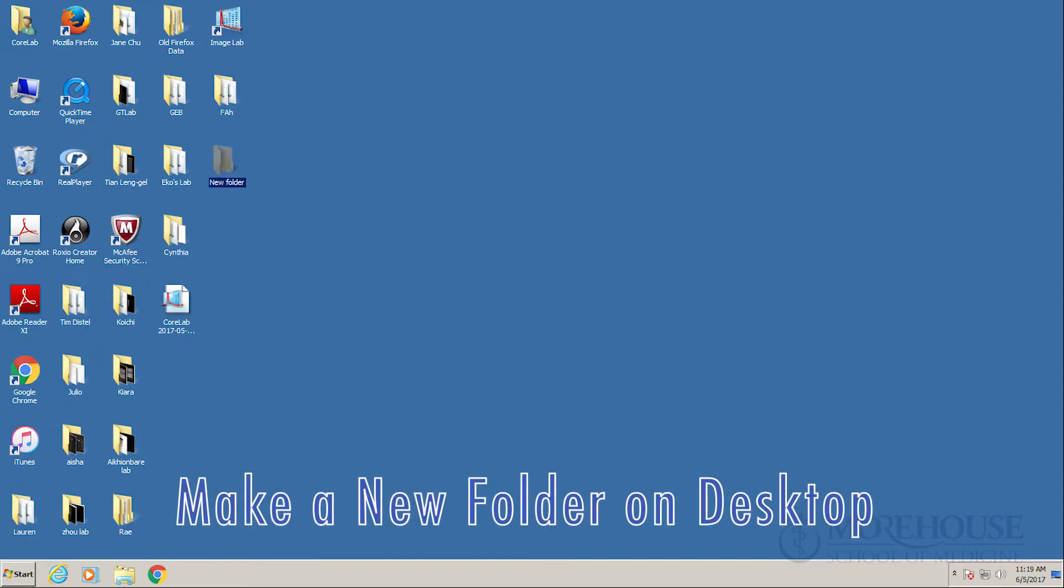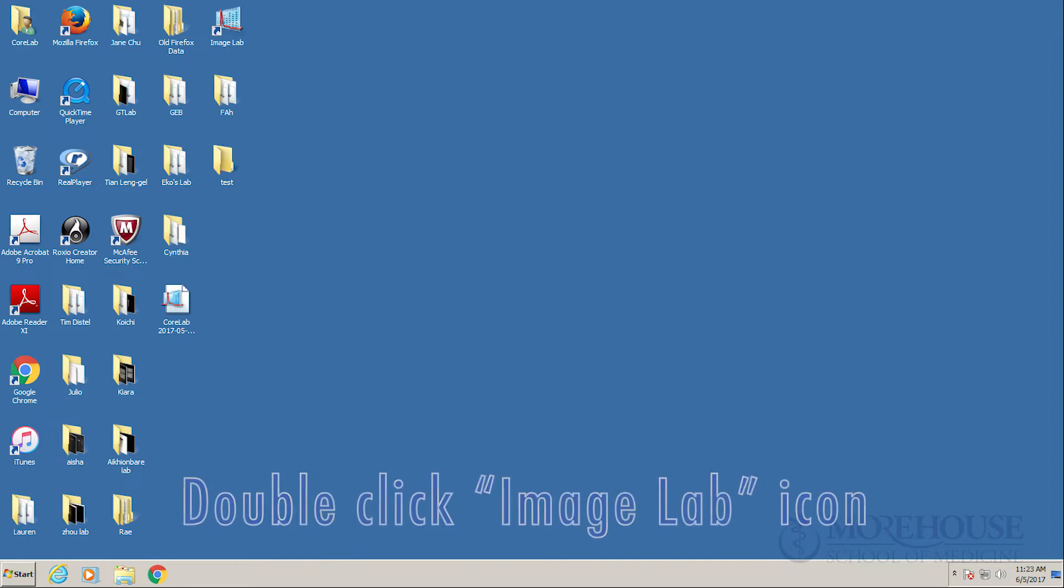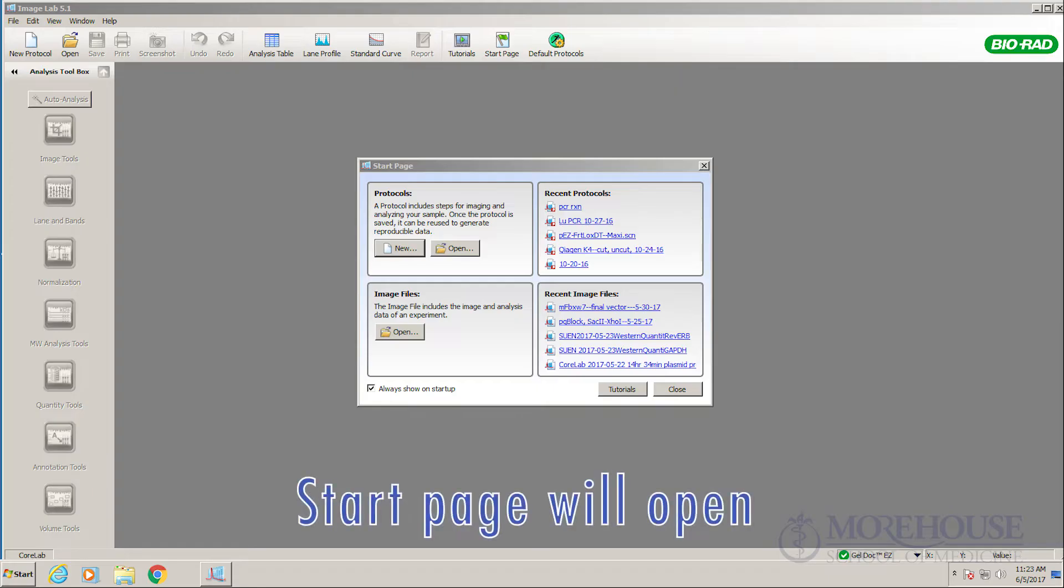Make a new folder on desktop. Double click Image Lab icon. Start page will open.